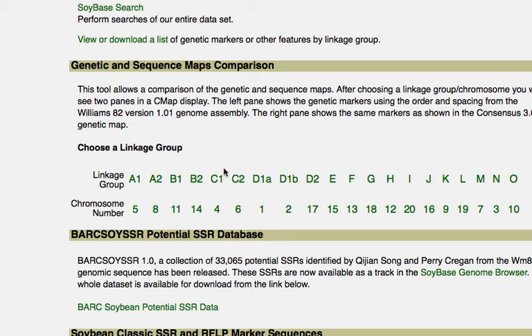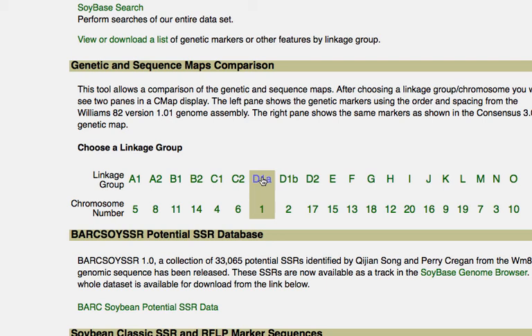This will allow you to compare the genetic map order with the sequence map order. As you're probably used to by now, you just simply pick a combination to compare.